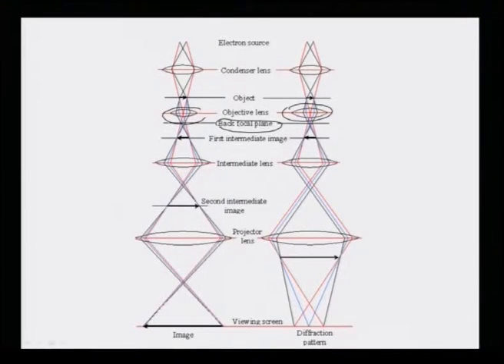If the object is periodic, that is a crystal, then the diffraction pattern will be periodic. If the object is continuous, the diffraction pattern will be continuous. These are all understandable. This is the classic sense of diffraction pattern formation in a classical TEM. That is normally routinely done in the microscopes. Whenever we insert a sample, the first thing we do is find crystals, then put the selected area aperture in and get the diffraction pattern.